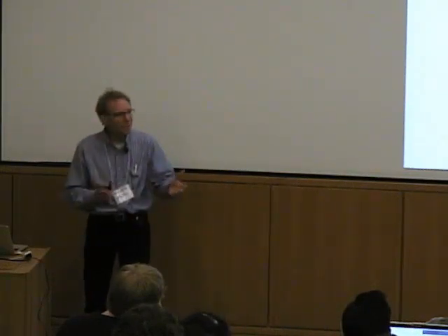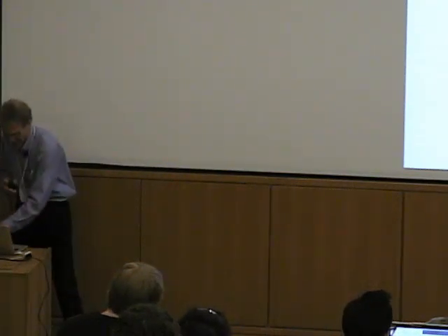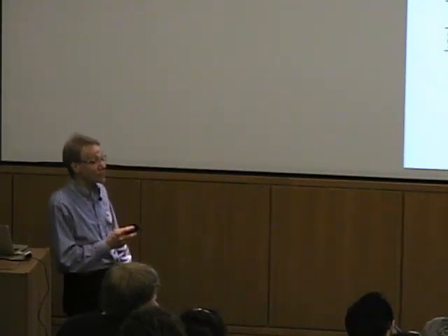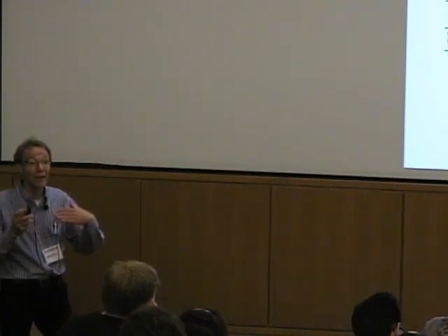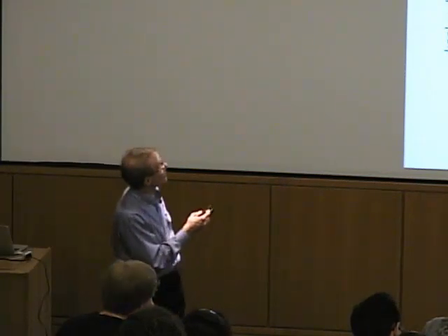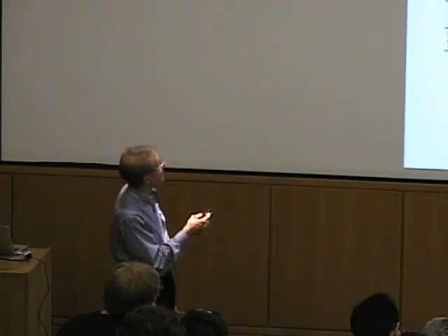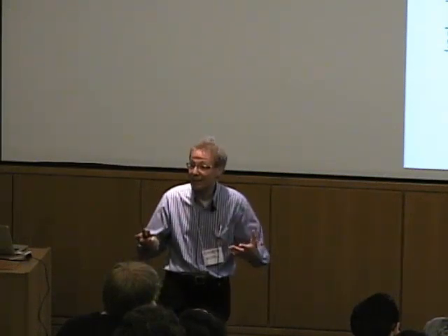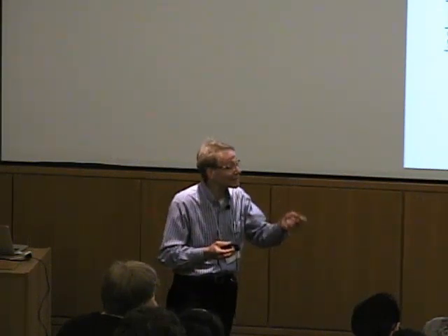Now, this buffer interaction, you may say, how am I going to find that information? Just a tip: a lot of this isn't available in the databases. So what we've been doing in my group, and other groups have been doing as well, is taking measurements of metal ions binding to very well-known ligands. Here's TEPA and DTPA. These are simple amine ligands for which the copper ligand stability and enthalpies are well known.